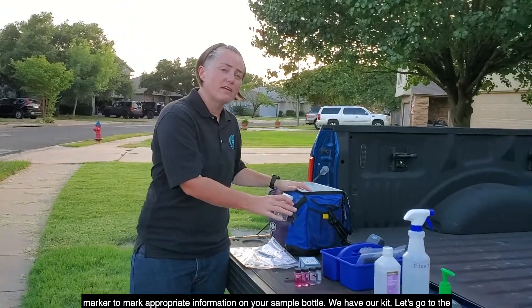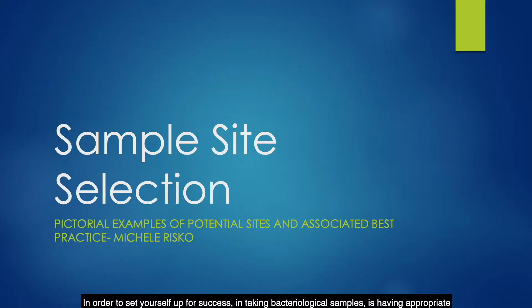We have our kit — let's go to the field. In order to set yourself up for success in taking bacteriological samples, you need to have appropriate sample sites. This portion of our presentation will cover sample site selection with pictures showing you potential sites and associated best practices.